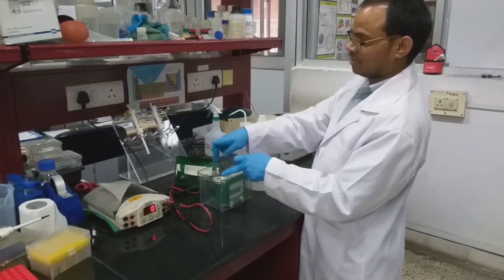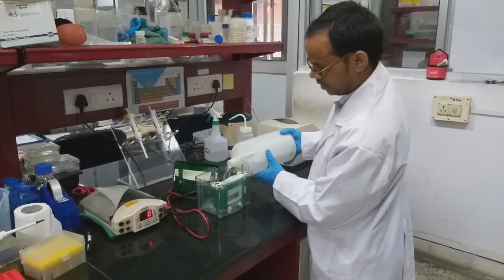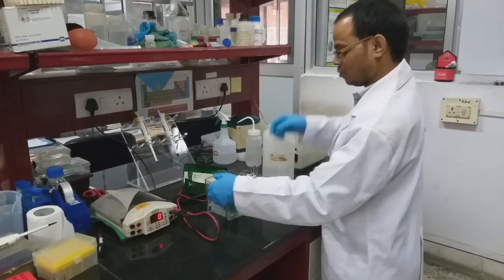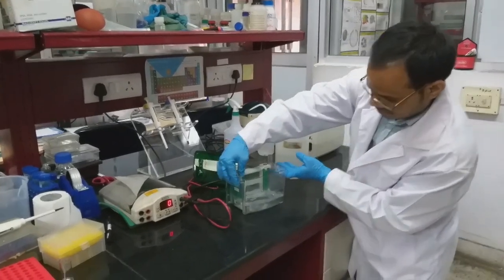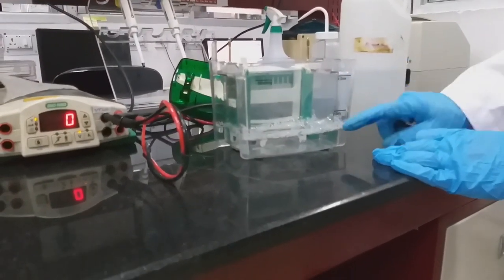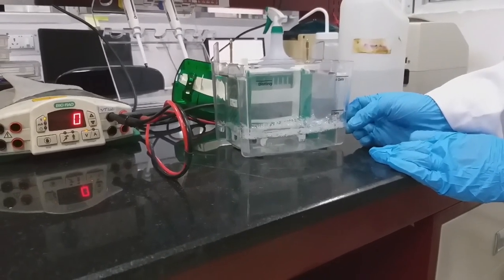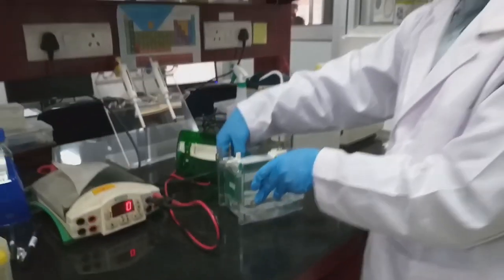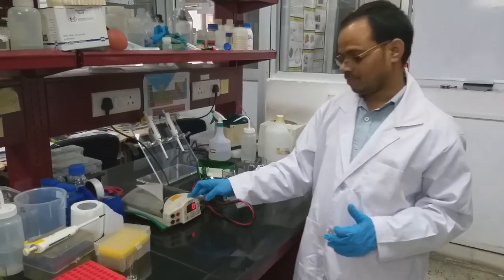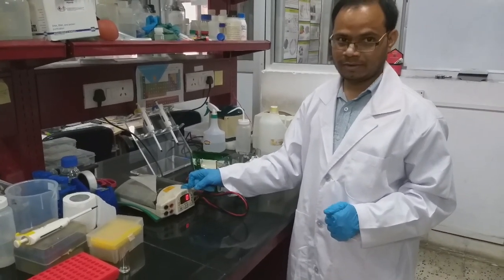We added it in this tank, but the main tank surrounding this one, we have to add up to the mark. For reference, you can see here, for 4 gels we have to add the buffer till here, and we have to load outside this gel. For 2 gels here, and for 1 gel we can add like this. This is the power pack where we can adjust how many volts we want to run.